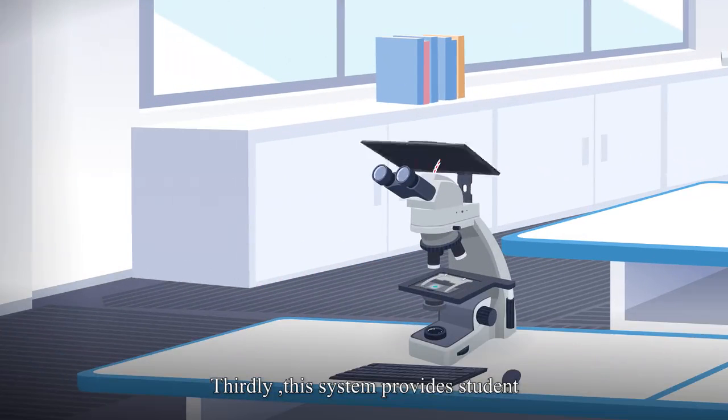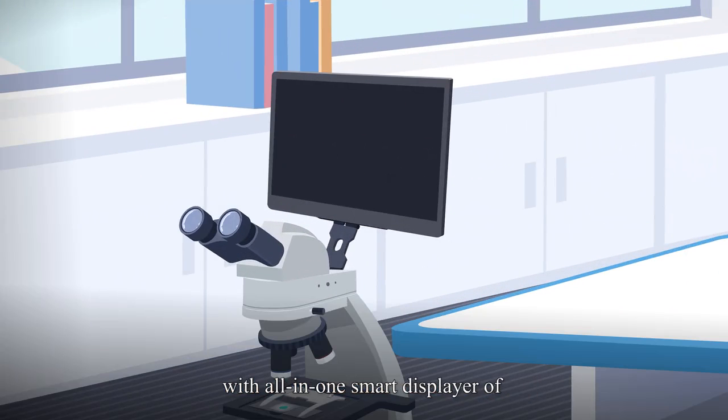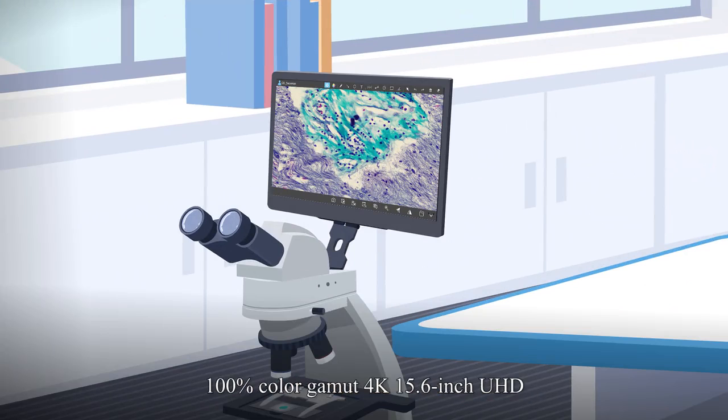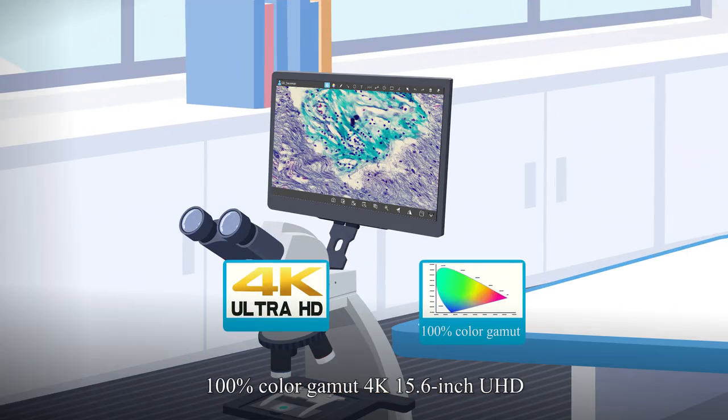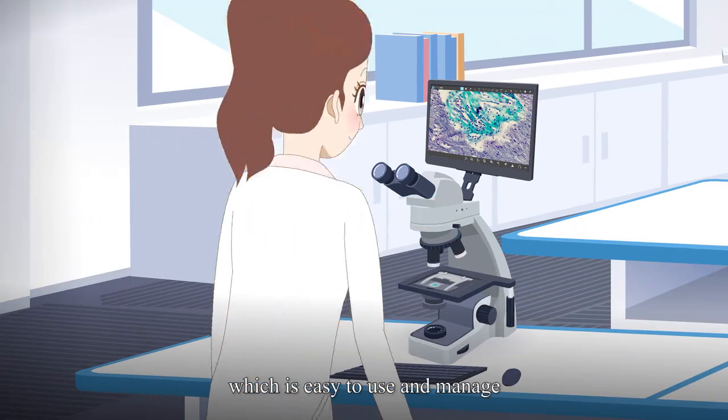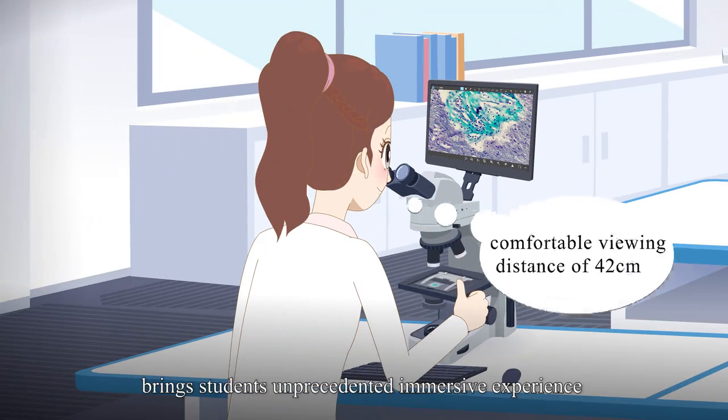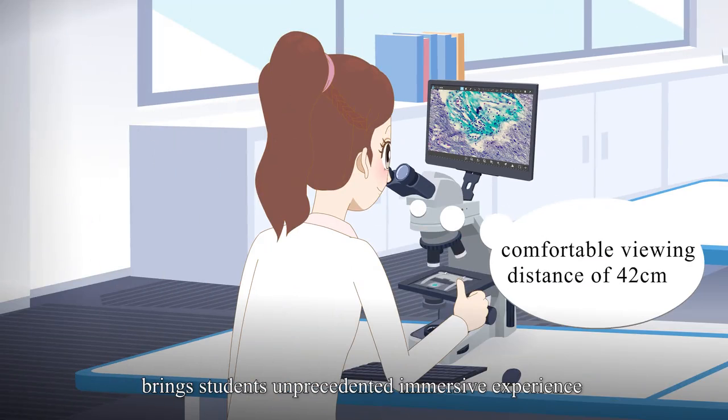Thirdly, this system provides students with all-in-one smart displayer of 100% color gamut 4K 15.6 inch UHD, which is easy to use and manage, bringing students unprecedented immersive experience.